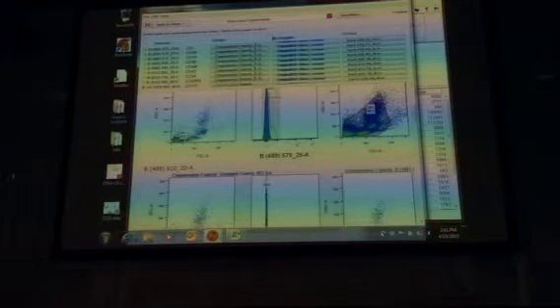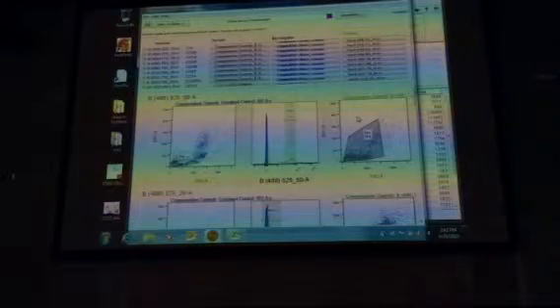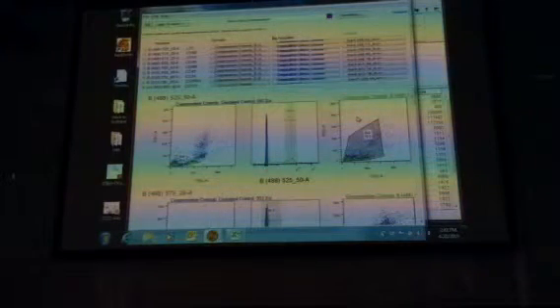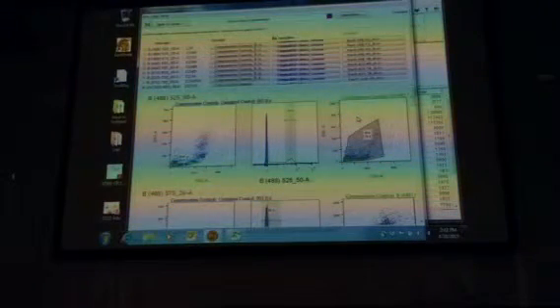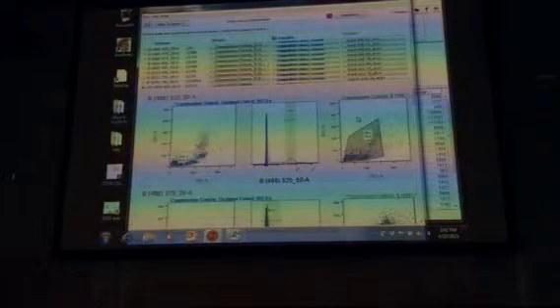The one you said was debris, how did you know that that was debris? Just simply based upon size. You know, when we set the machine up. Okay. So this is very similar to what you did in your previous assignments. The difference here is that you're going to have to go through all of them and do it.